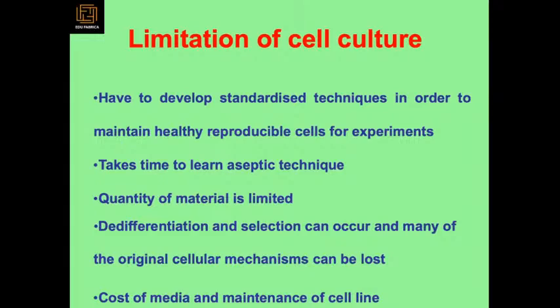Some of the limitations are that we have to develop standardized techniques in order to maintain healthy, reproducible cells for experiments. And it takes time to learn aseptic techniques also. It doesn't come within a day. For me to be regular with cell culture, it took me 1 month to become professional with it, so that I do not make any mistakes or cause any contamination. Then the quantity of material is limited, and the cost of media and maintenance of the cell line has to be managed.